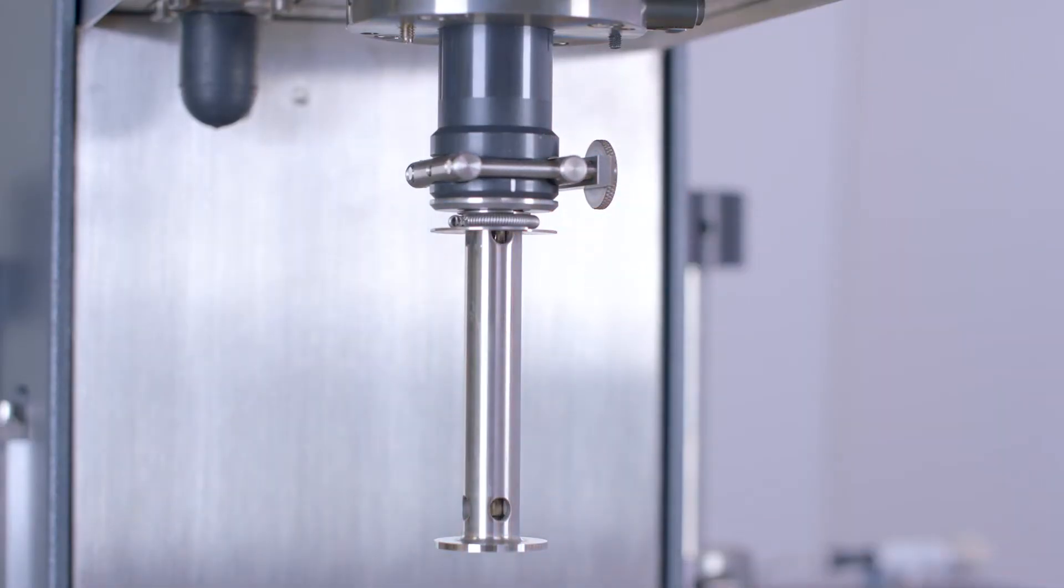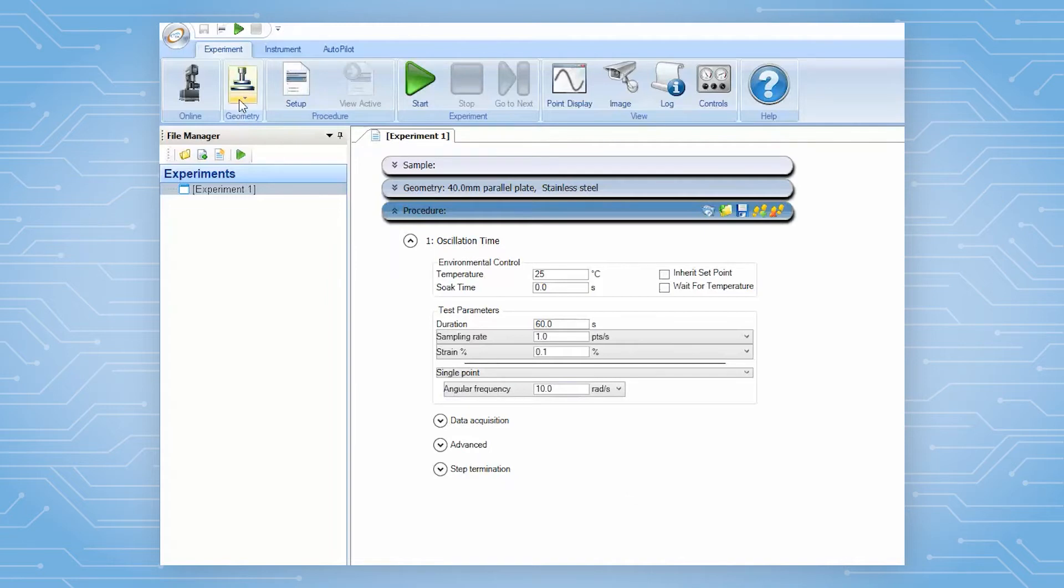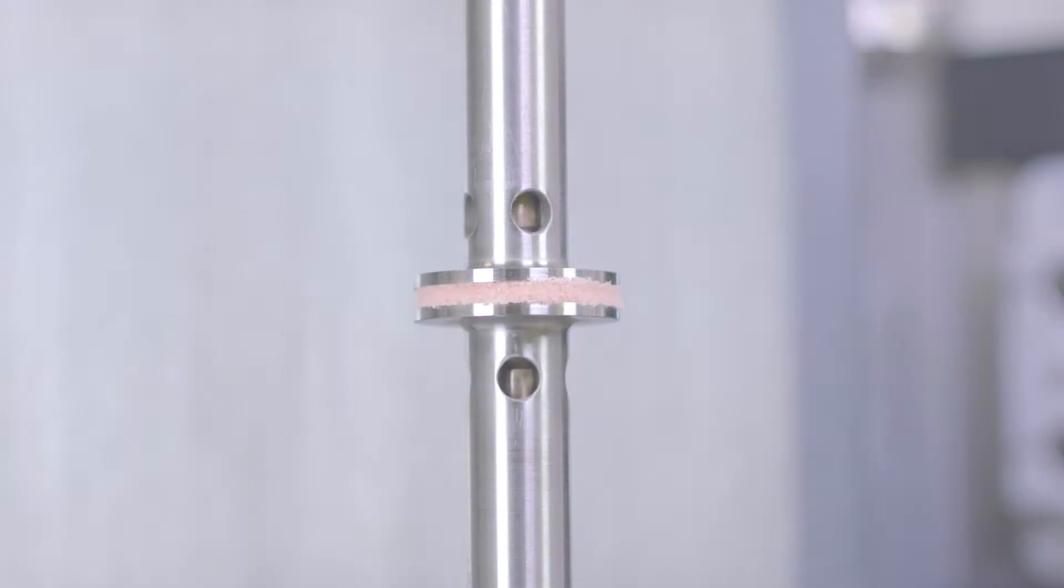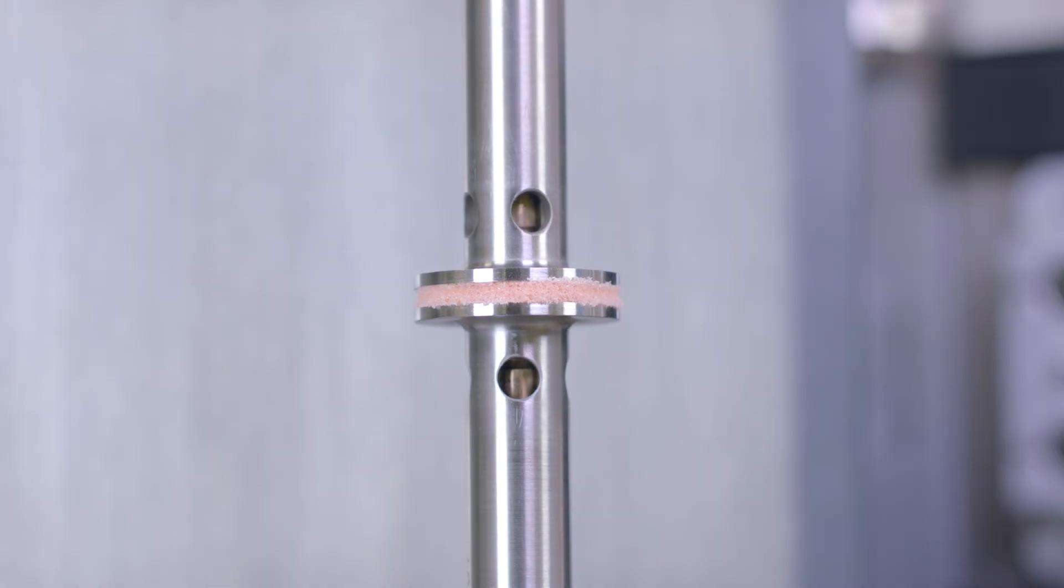Then, in TRIOS software, select compression as the testing geometry. Since this same parallel plate geometry can do both shear and compression measurement, it is important that the operator select the correct geometry name for the correct type of test.